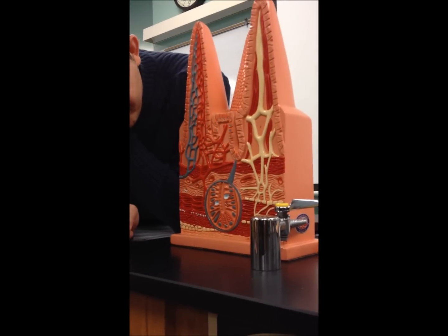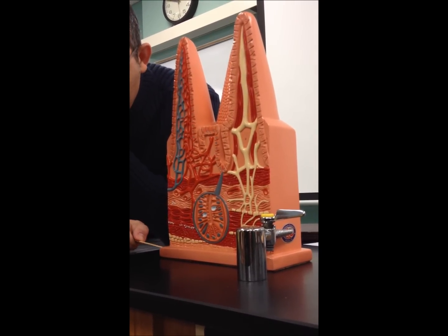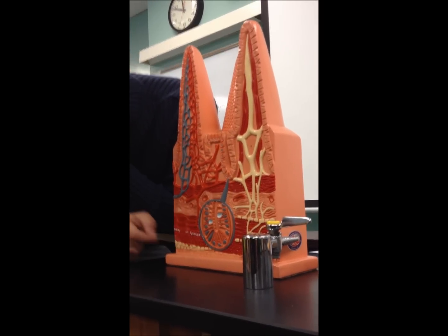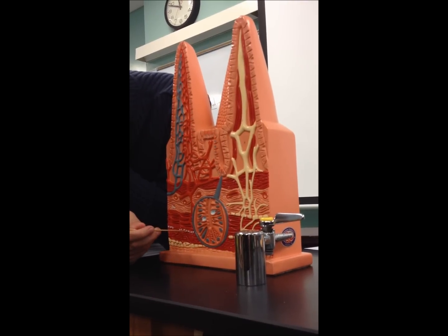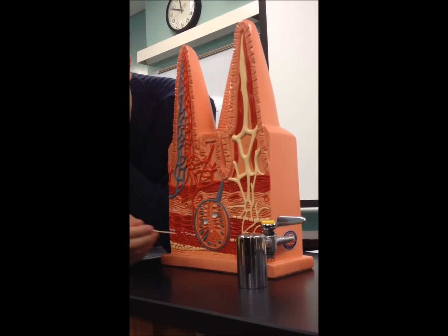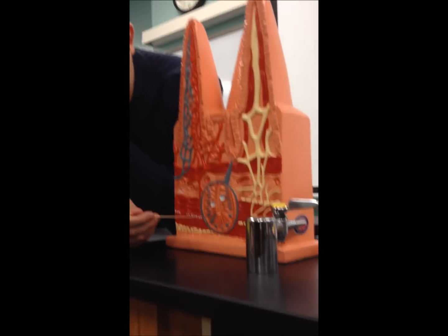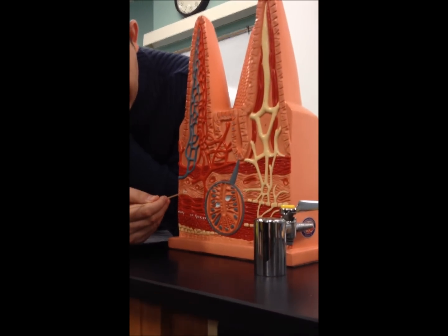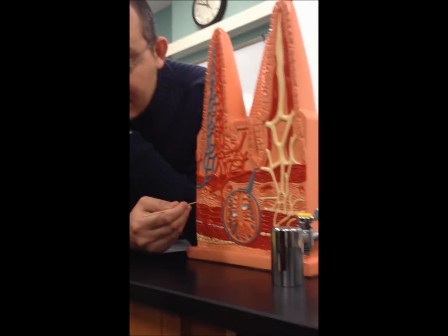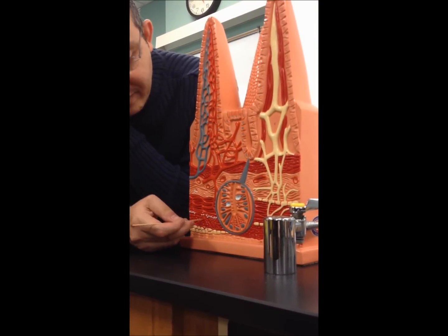So where is the oblique one? You said there's an oblique one. No, the oblique layer is in the stomach only, not in the small intestine. And then of course we have the serosa here. What is the thing in white? What do you think? Blood cell? No, the white are the nerve plexus. We have the myenteric nerve plexus in the muscularis externa, and the submucosal nerve plexus in the submucosa.